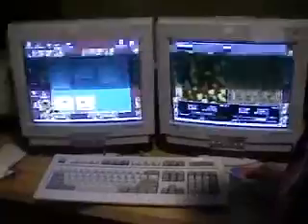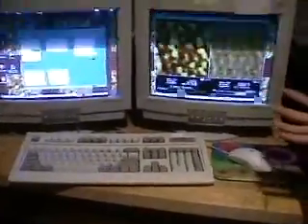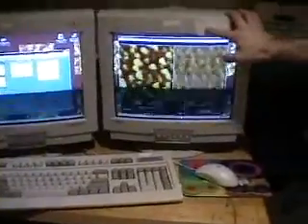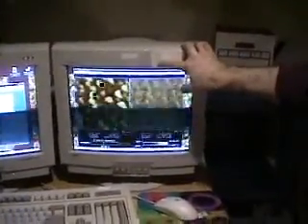Now we're at a point where we're ready to take an actual image, and so I can go over here and click. First I want to decide what size image I want to take. So let's say I'm going to take a 5 micron image. I look at the table here: 10 microns I can go 1 hertz, 3 microns I can go 2 hertz, so maybe I'm going to be conservative. For 5 microns I'm going to set it to 1 hertz scan rate.